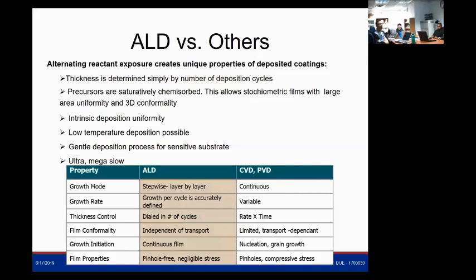You can really count those little pulse cycles, and that will give you the number of aluminum oxide layers that you have grown. Well, it's a very slow process comparatively, because you're growing layer by layer, atomic layer by layer, but you can do this at very low temperature, and it has a super nice control, because once you have covered the whole surface, you're done. That is it. And then it will give you a very nice conformality, like I will show you guys.